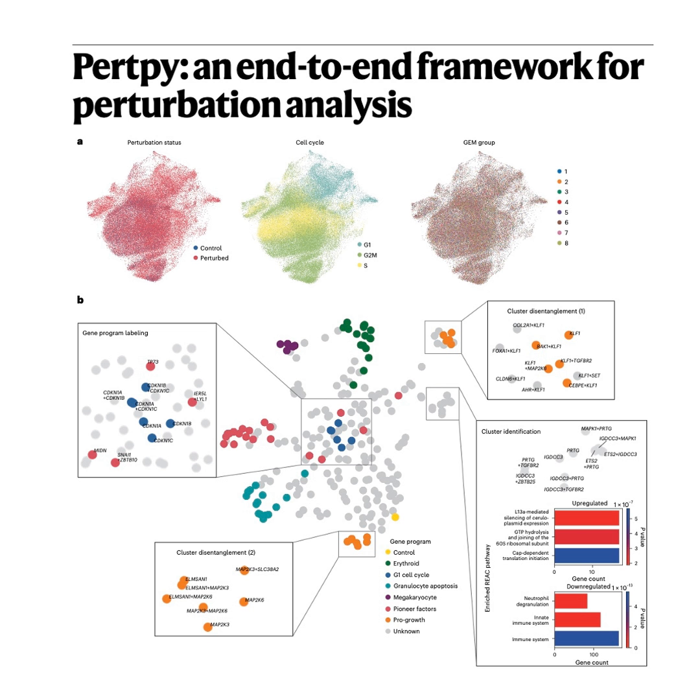Okay, let's unpack this pipeline, starting right at the beginning. You do a CRISPR screen. The first massive challenge is just figuring out which genetic modification went into which cell. We need to talk about guide RNA assignment. This is step one, linking the cause to the effect.